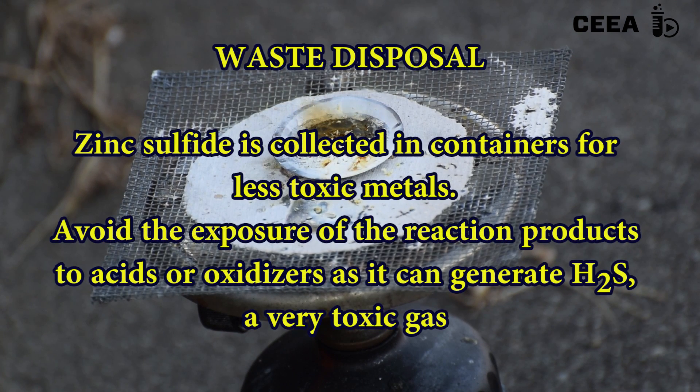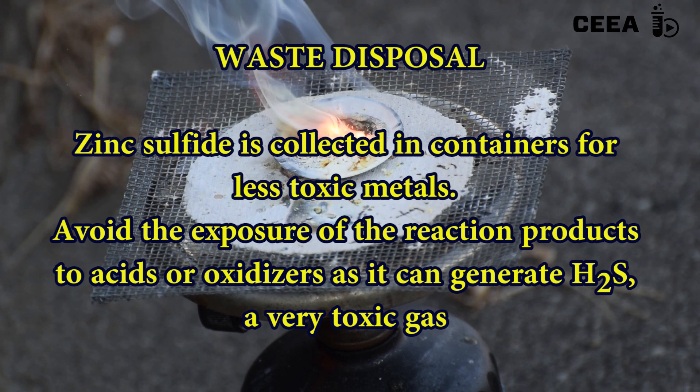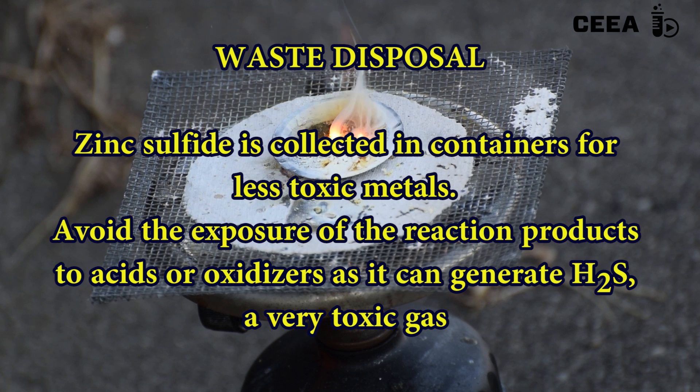At the end, discard the zinc sulfide in a container for less toxic metals. Do not treat with acids, as it generates poisonous hydrogen sulfide.